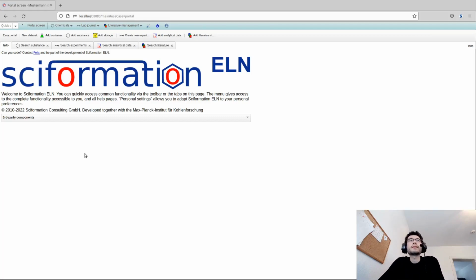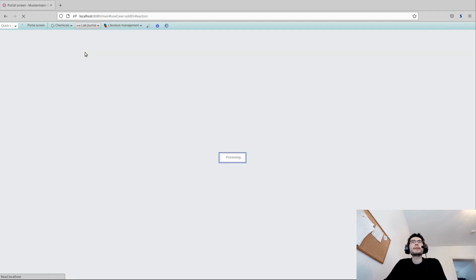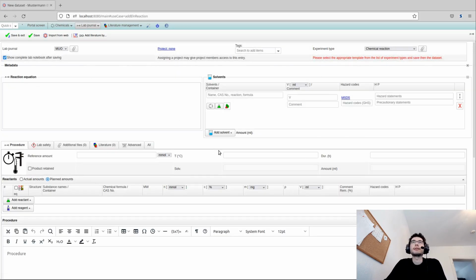Hello, in this video I would like to show you the electronic lab notebook of Sciformation ELN. I will show you how to create, organize and customize your experiments. Let's go to Lab Journal and create new experiment and take a look at this menu here.